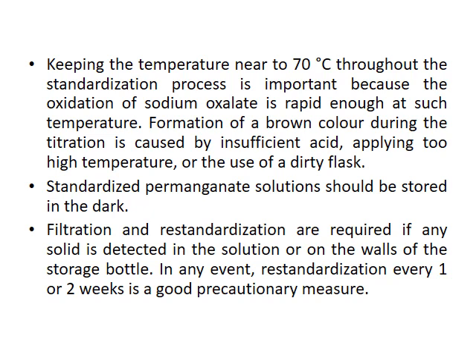Formation of a brown color during the titration is caused by insufficient acid, applying too high a temperature, or the use of a dirty flask. Standardized permanganate solutions should be stored in the dark. Filtration and restandardization are required if any solid is detected in the solution or on the walls of the storage bottle. In any event, restandardization every 1 or 2 weeks is a good precautionary measure.